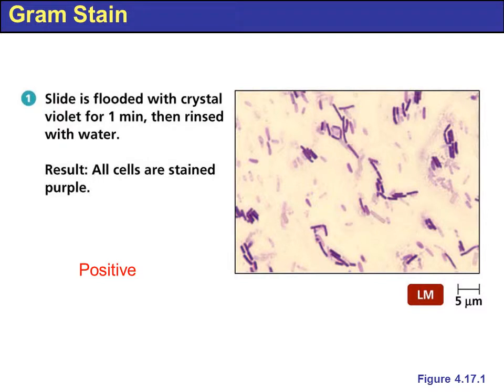So this is step by step how to do it. Step 1. Slide is flooded with crystal violet for 1 minute. Then you will rinse with water.